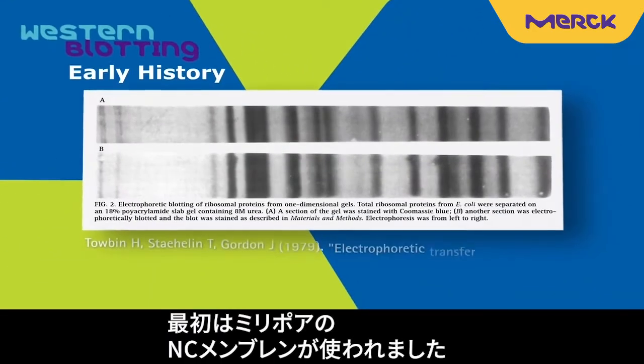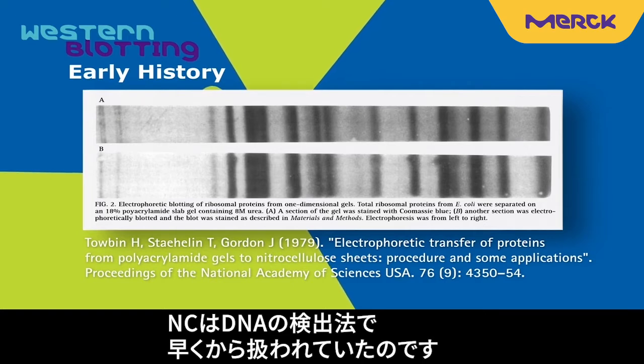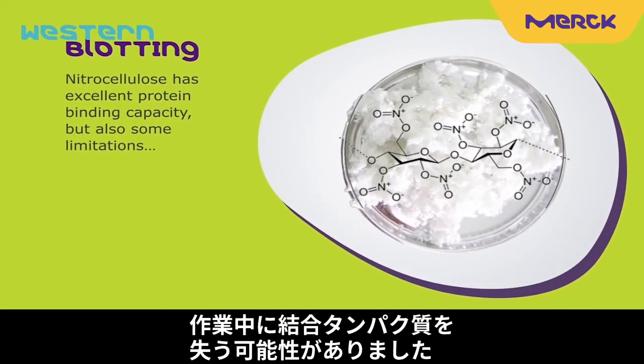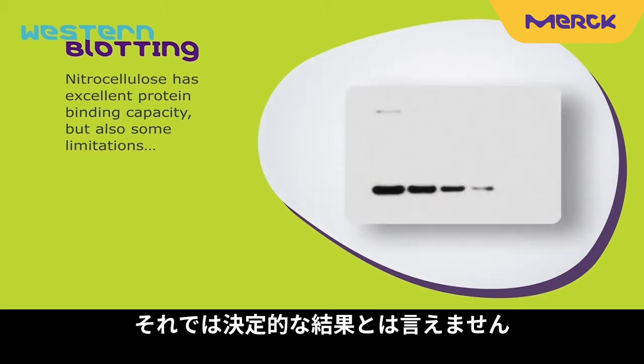The first protein blotting procedures were performed with nitrocellulose membrane from Millipore. Nitrocellulose was adapted from an earlier method for DNA called southern blotting. Nitrocellulose has limited protein retention. Bound proteins may be lost during immunodetection, antibody binding, and wash steps. This can lead to low signal or inconclusive results.